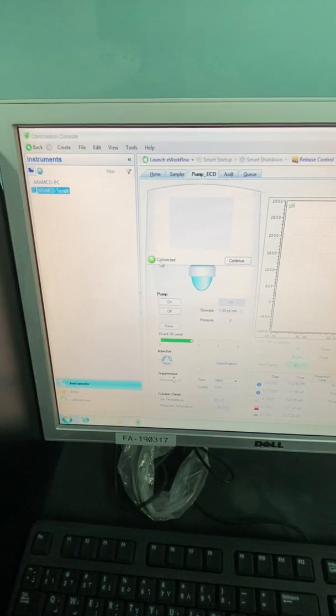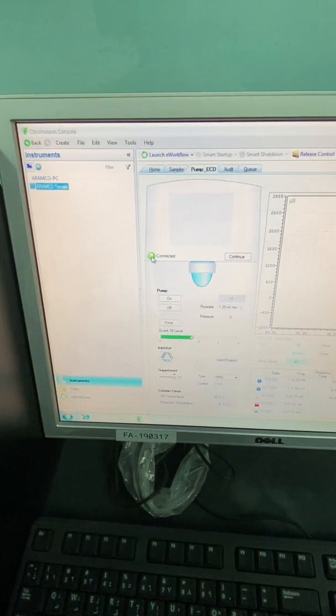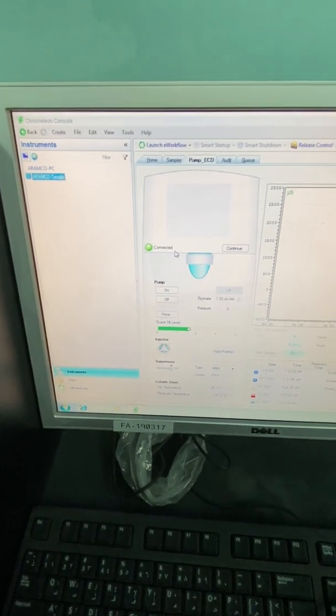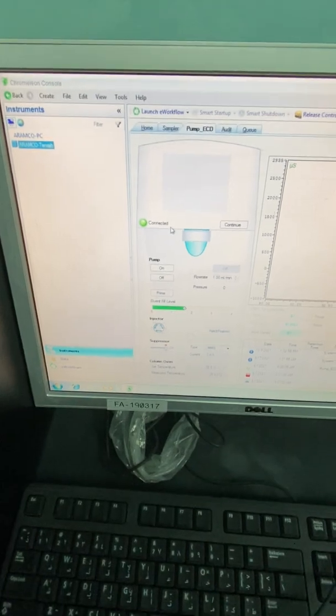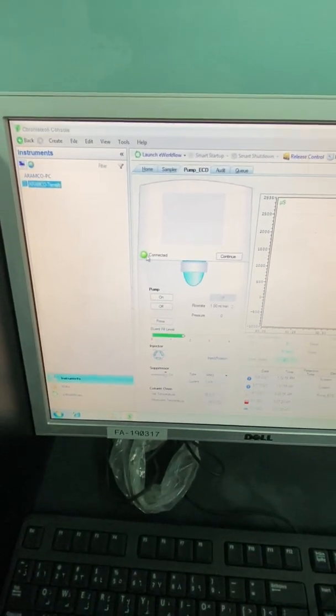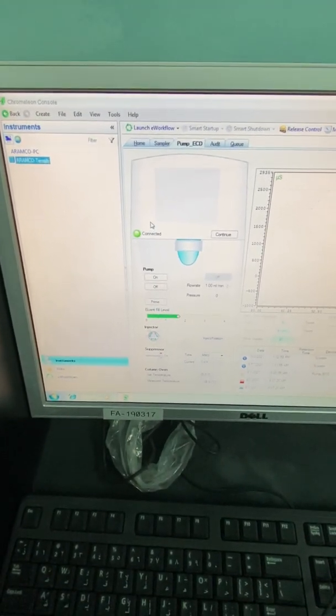First of all, to connect the instrument, you have either to press this one. This is now connected. If you want to disconnect the instrument, just press again. It will be disconnected.